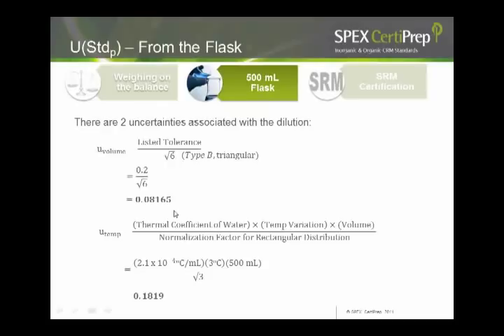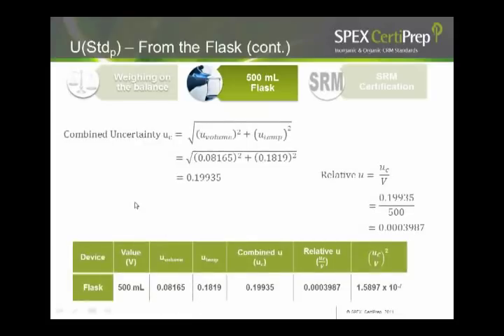Then I measured the concentration by ICP, and this represents the uncertainty due to ICP measurement for SRM. Again, a similar process was taken for the ICP measurement for the sample, so that component has to be considered. So now you have 4 major components and very many minor components to each of these 4 major components. So usually it is better to represent all the components by means of this fishbone diagram. This gives you a better idea how to proceed.